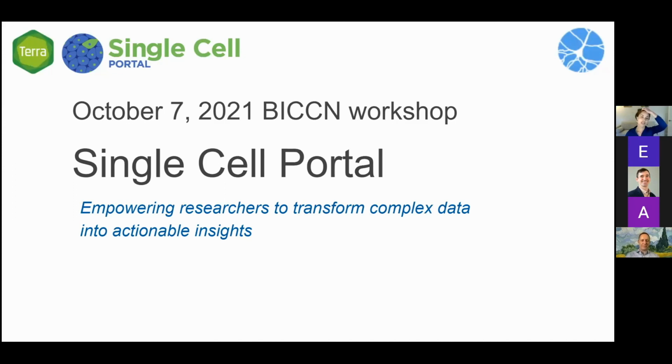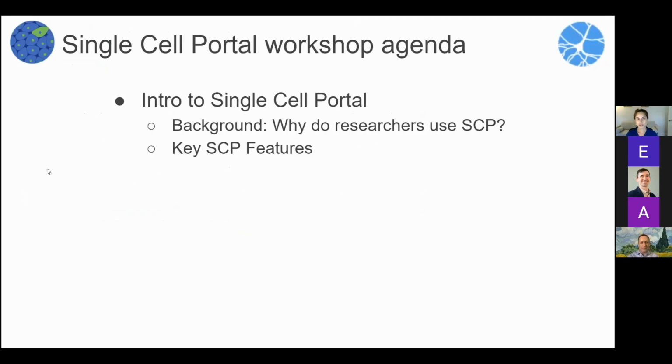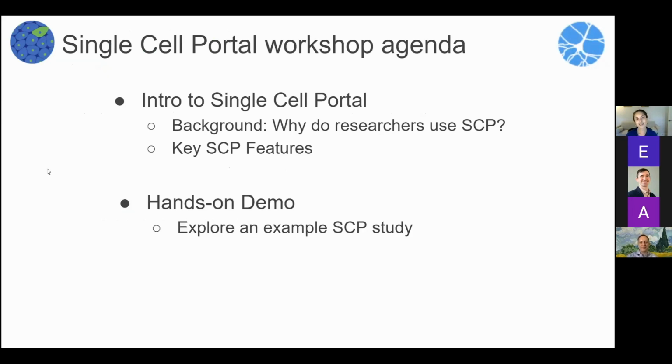So as Liz mentioned, today I'm going to tell you a little bit about the single cell portal, which is a web-based data portal for sharing and exploring single cell genomics data. I'm going to do this in two parts. First, I'm going to show you some slides where I'll give you some background and walk you through some of the features of SCP that I think are the most cool and interesting. And then I'll also take you through a hands-on demo so that you can see how these features work in real life.